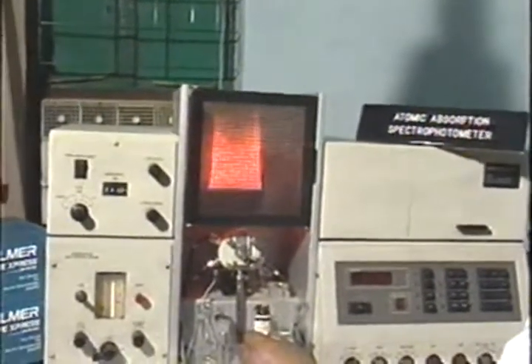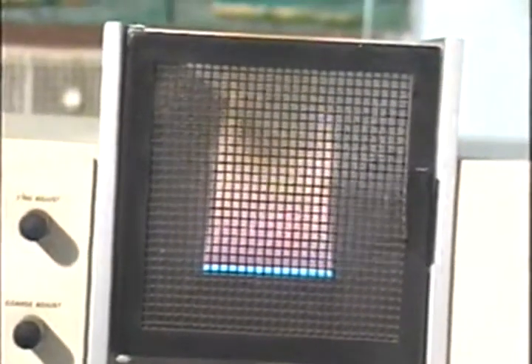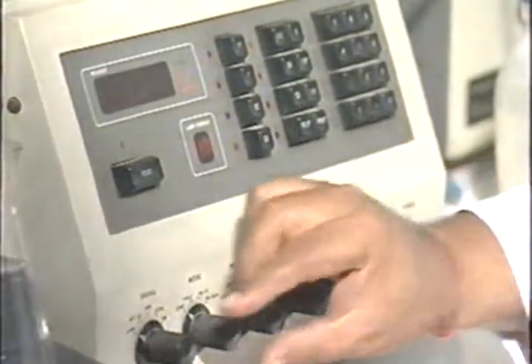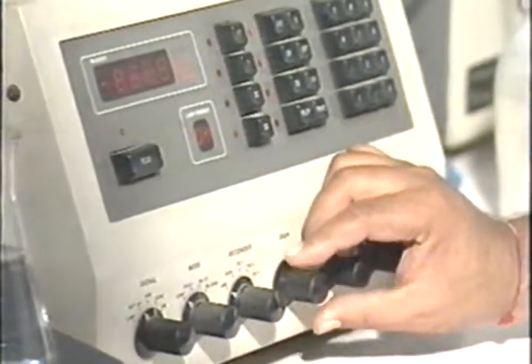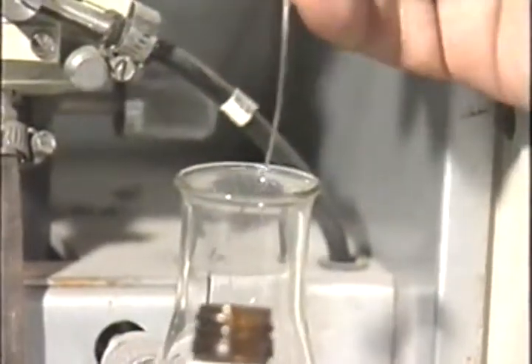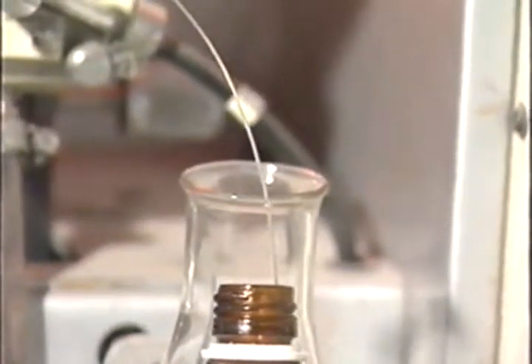Atomic absorption spectrophotometer is used for the testing and study of metallic drugs. Here the sample is subjected to an oxyacetylene flame at a very high temperature of 2200 to 2800 degrees centigrade, and at the very same time the light from the hollow cathode lamp made of the same elements passes through the flame and gives an absorption spectrum of the same elements. The instrument is used for the study of all biochemic drugs up to 6x potency and other such drugs having metal as their ingredient like copper, nickel, gold, silver, iron, lead, tin, zinc, etc.